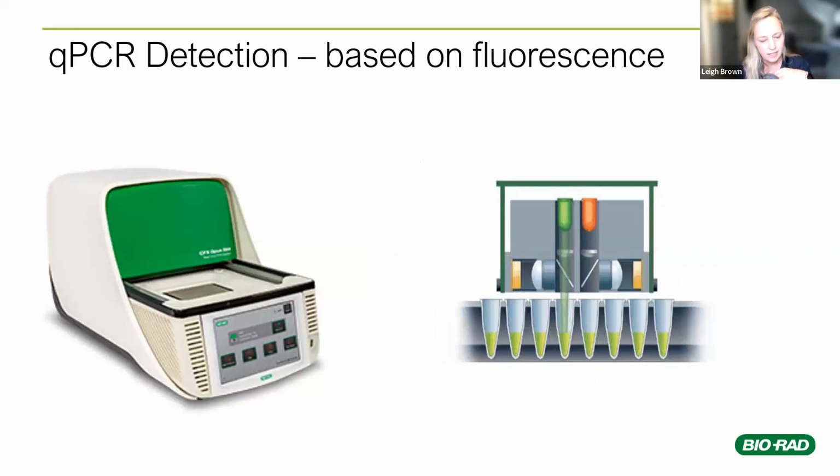So by incorporating these fluorescent DNA markers, probes or SYBR, things like that, into the reaction mix, we can detect the relative amount of nucleic acid present in the reaction in real time. And we can do that by running that with a reference gene. Okay, so after every cycle of amplification, fluorescence of a specific wavelength is emitted by an LED housed inside of this optical module, right? So on the top of this machine here, it's absorbed by a DNA-specific fluorescent marker inside the reaction, and that is going to re-emit that energy at a different wavelength that's then detected by the system.